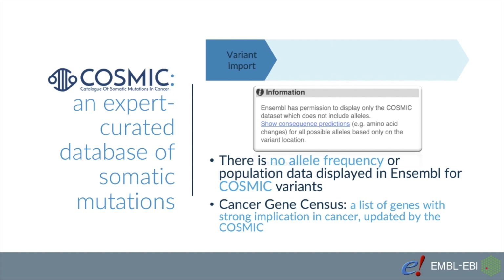However, we don't know if people coming to Ensembl have their own licenses. Therefore, we are not allowed to show you the allele information or allele frequency. We only show you the position of those important variants, and we also show you the consequence predictions for all possible alleles based on the variant location alone. And then we link out to COSMIC for further exploration.